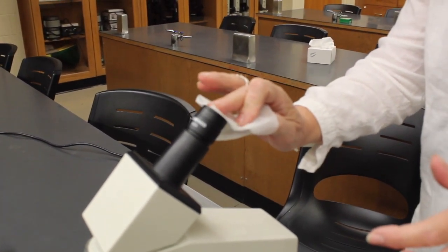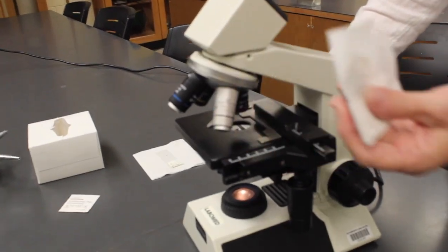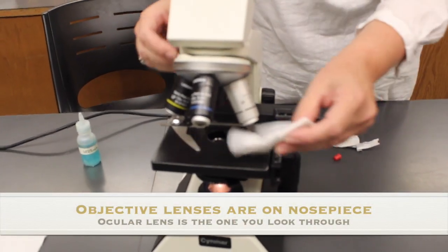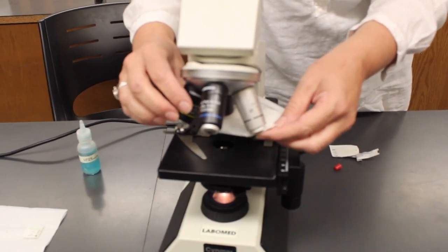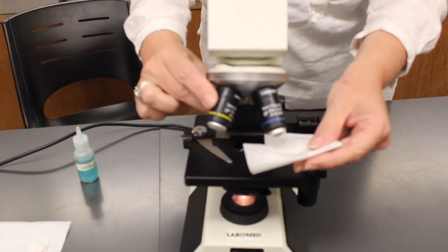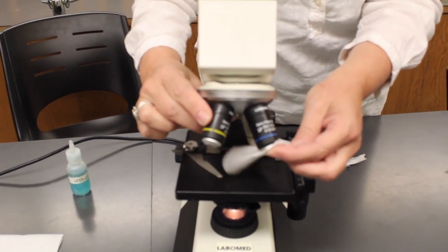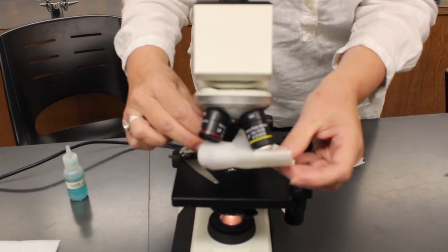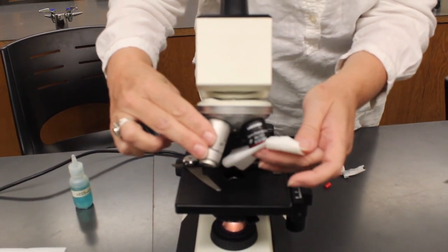And then you can dry the ocular lens. And then you're going to do the same thing for all of the lenses on the nose piece. These are part of the compound lenses. So this is the oil immersion lens. We don't use that in Bio 100 or 101, but you might be using it when you go into anatomy and physiology. This is the 100X, or sorry, this is the 40X. This is the 10X. And then this is the 4X.